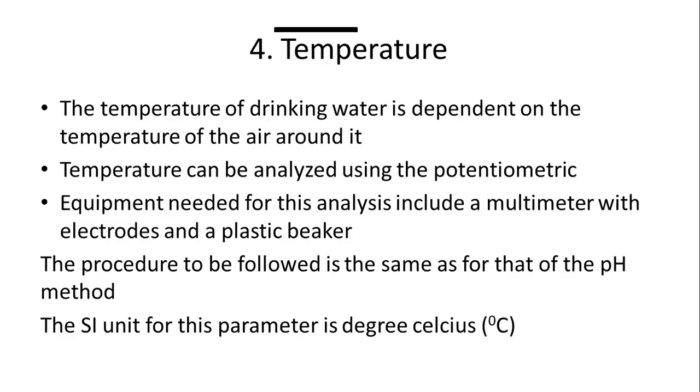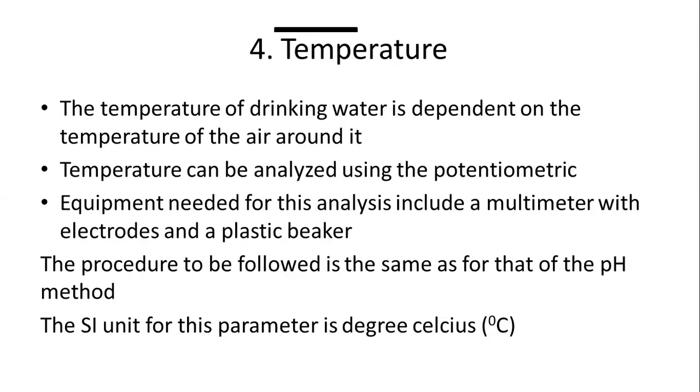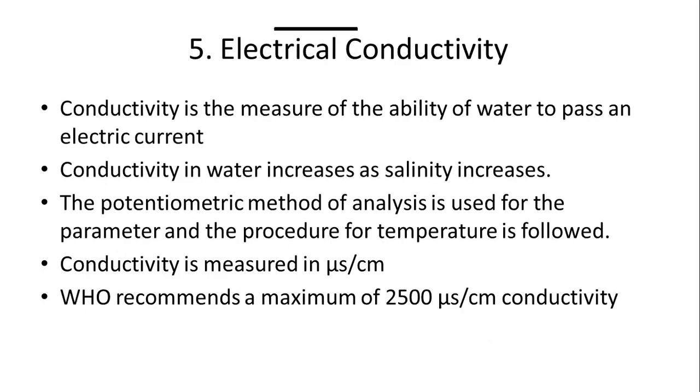So basically, temperature maybe affects the taste of the consumer. Sometimes the consumer wants cold water, so the consumer can regulate the temperature of the water they want. There's really no set temperature for drinking water as per the WHO regulations. You can drink whatever temperature of water you want. We'll move on to electrical conductivity.